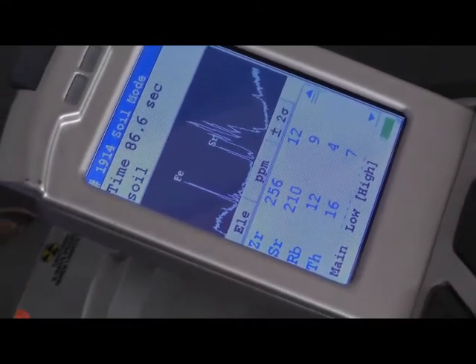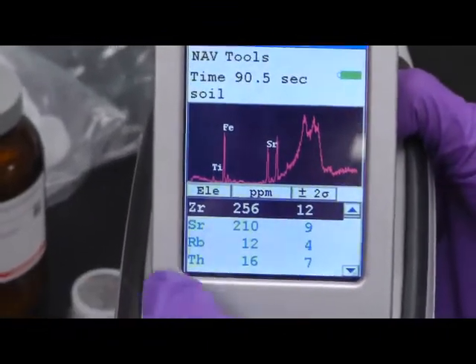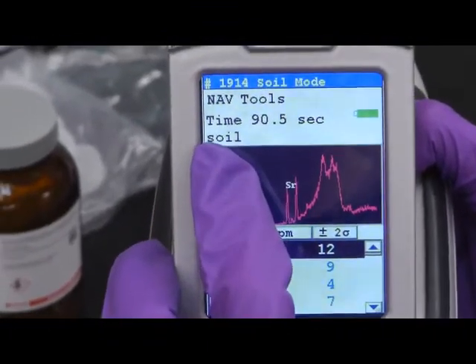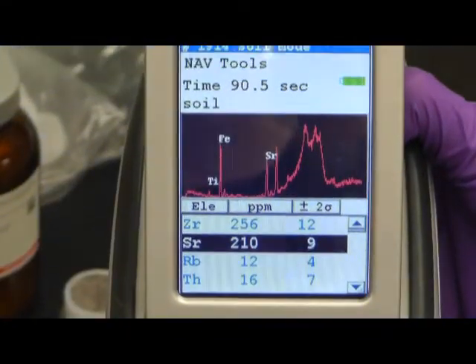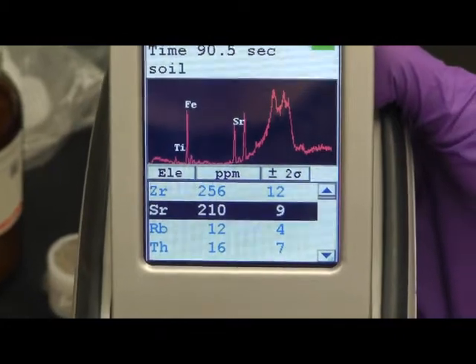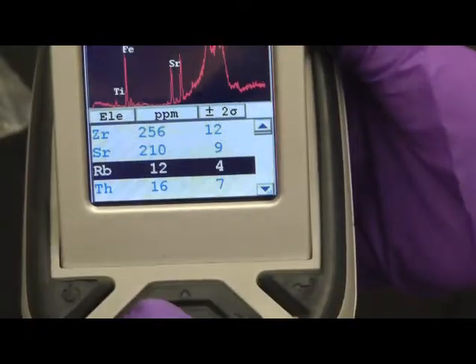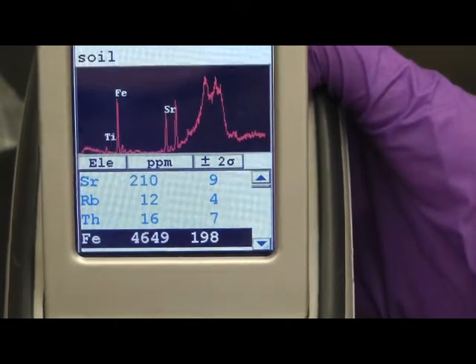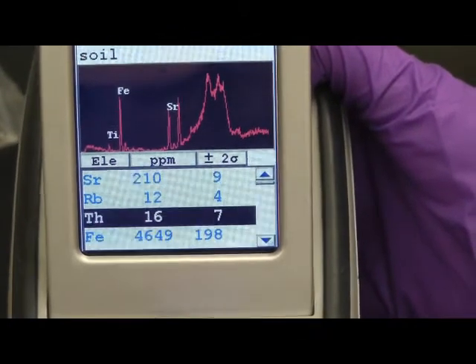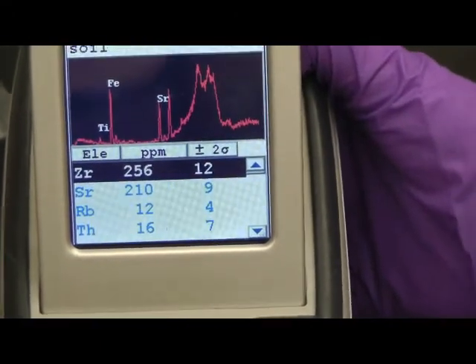And at about 90 seconds, what you need to do is to release the orange button. Measurement will stop automatically. The result, as we can see for this sample, which is called soil. And this is actually a clean reference soil sample with extremely low metal concentrations to start with. So it's not surprising that we didn't have high concentrations of lead or zinc or copper or cadmium or arsenic inside.